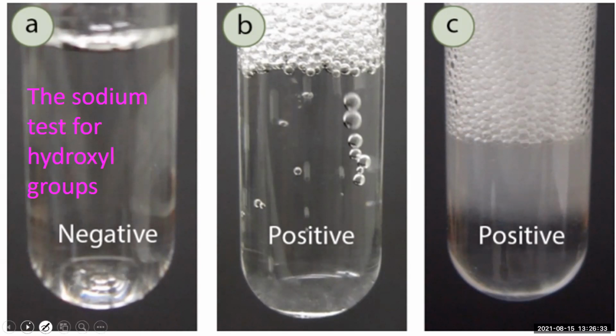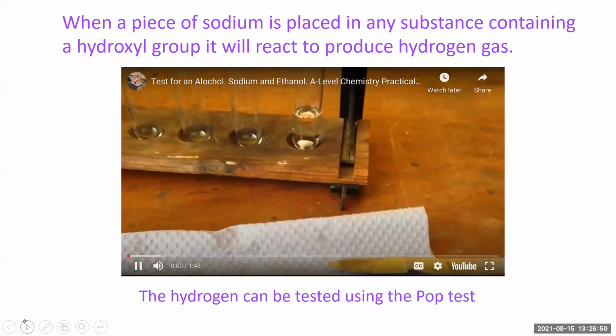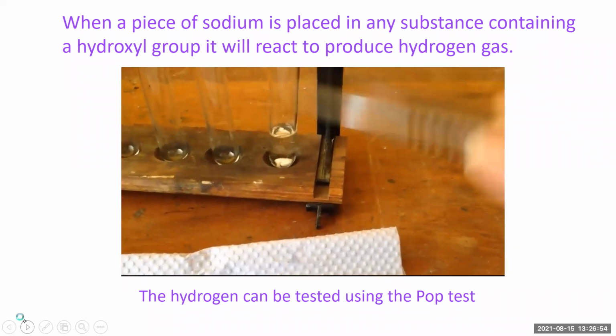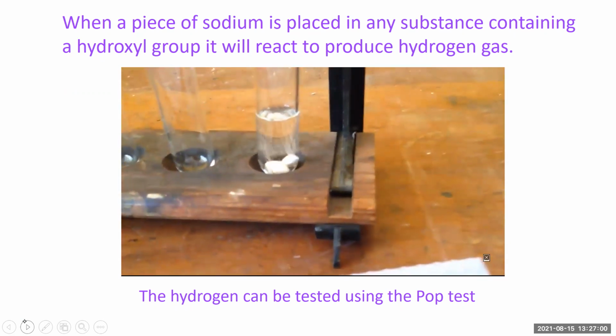All right, let's continue. So here I have a video of the sodium test being performed. So let's have a bit of a look here. We have here ethanol. So there's some ethanol in the test tube, and we're going to add some pieces of sodium to that ethanol in the test tube, and immediately you can see bubbles of hydrogen gas being produced.